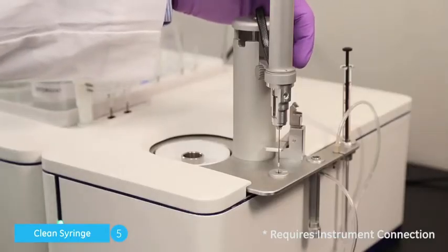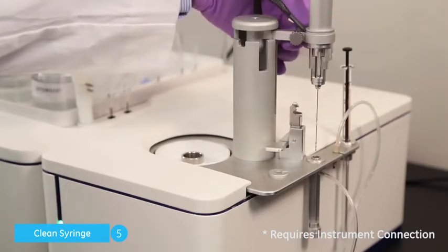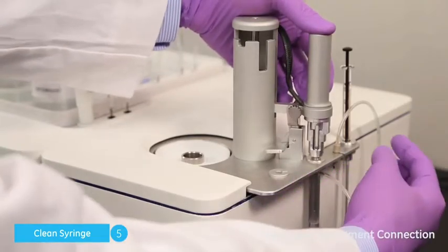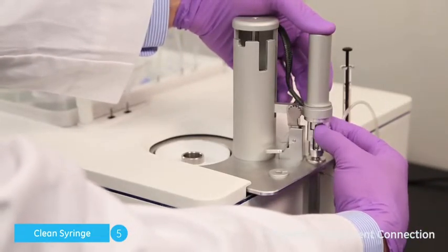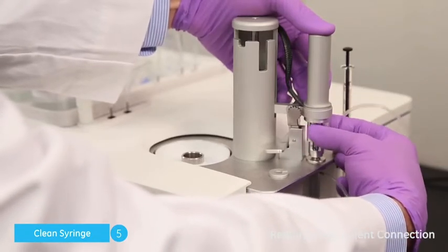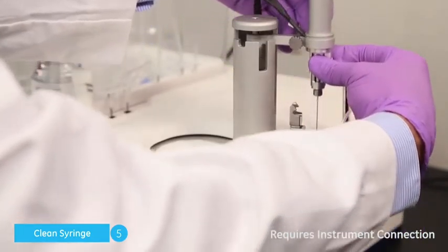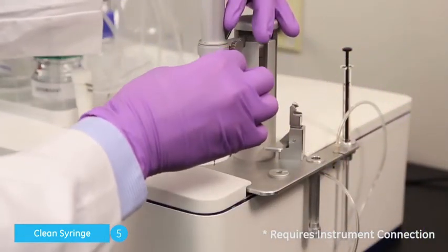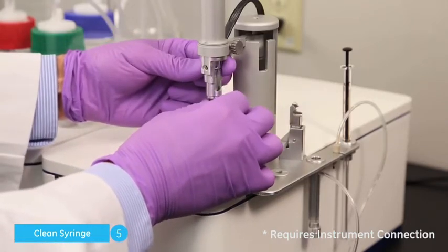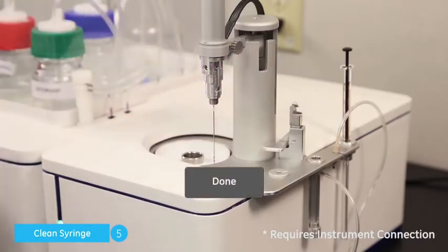With the retaining nut still sitting in a clean location, insert the pipette into the clean location without fully engaging the clamp. Start to reinstall the retaining nut by turning the pipette's rotating assembly with its threads engaged with the retaining nut. Move the pipette to the rest location and finish reinstalling the retaining nut, and click Done.